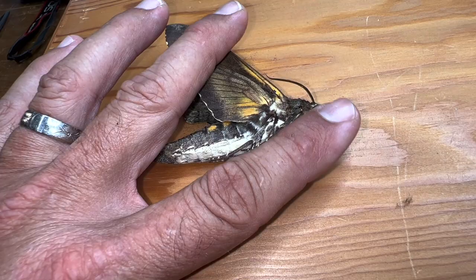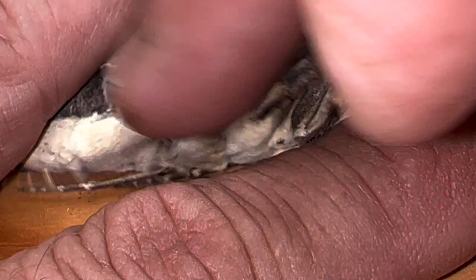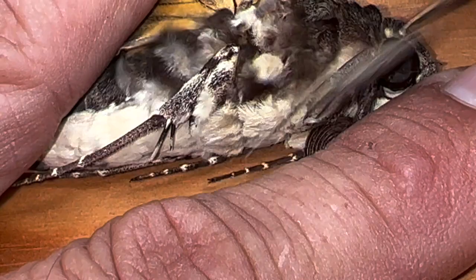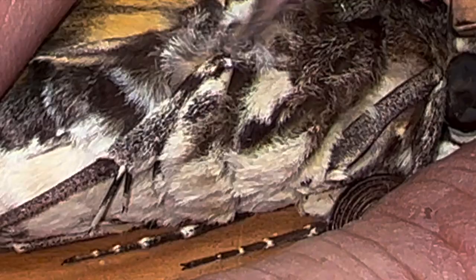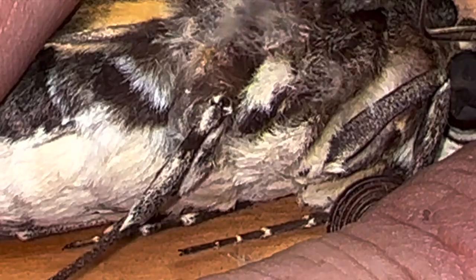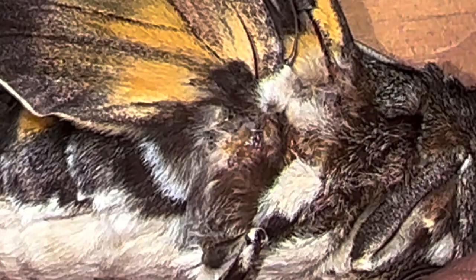Now you've got the forewing completed. Let me show you the hind wing. I'm going to have to remove some scales here. I just busted a leg off — that sucks. I hate doing this because I'm taking scales off my specimen, but I'm helping you guys know how to do this so when you catch a sphinx moth, you won't destroy it or mess up mounting it.